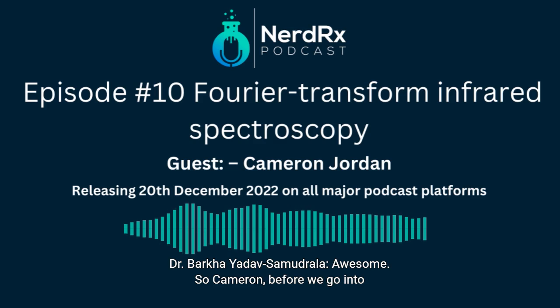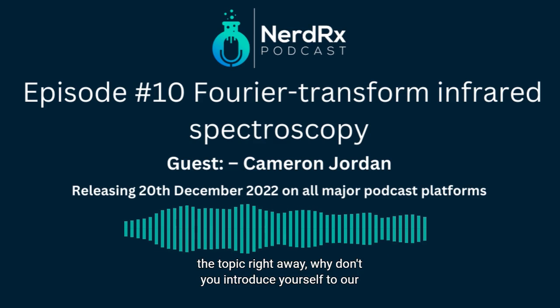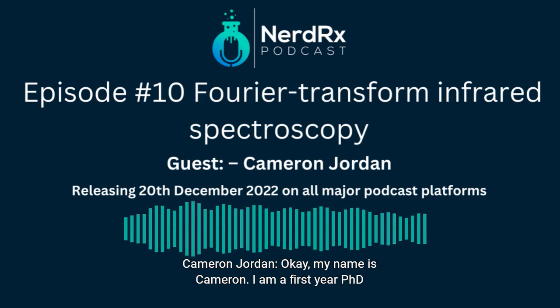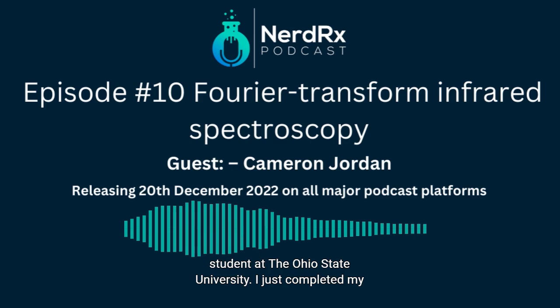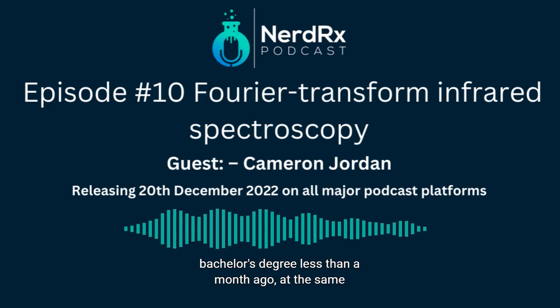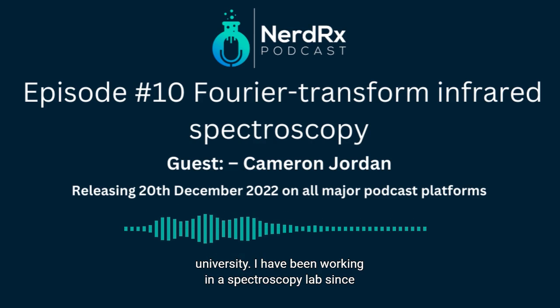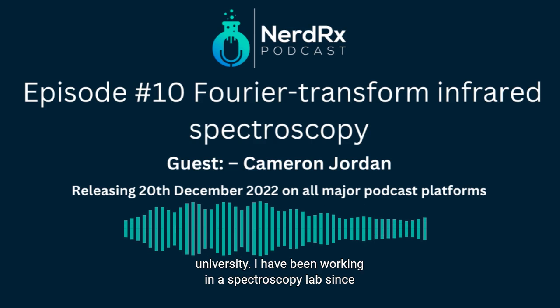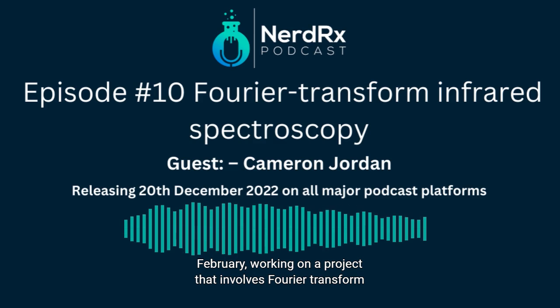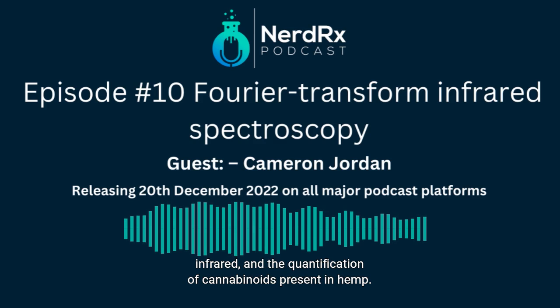Awesome. So, Cameron, before we go into the topic right away, why don't you introduce yourself to our listeners? Okay. My name is Cameron. I am a first year PhD student at The Ohio State University. I just completed my bachelor's degree less than a month ago at the same university. I have been working in a spectroscopy lab since February, working on a project that involves Fourier-transform infrared and the quantification of cannabinoids present in hemp.